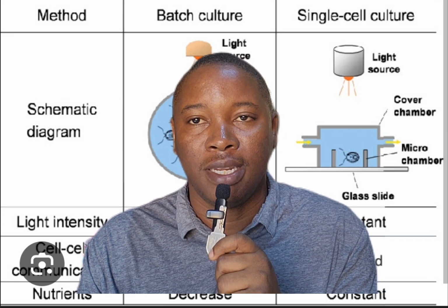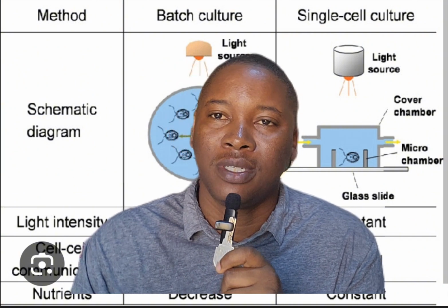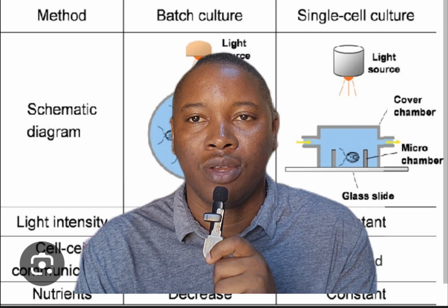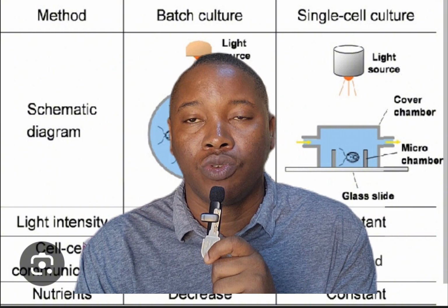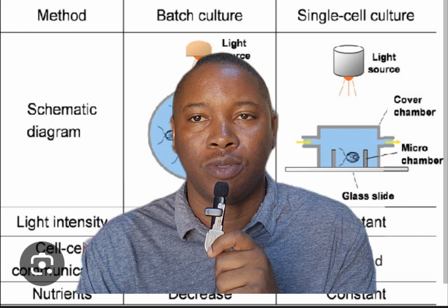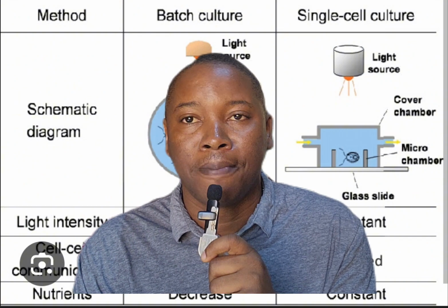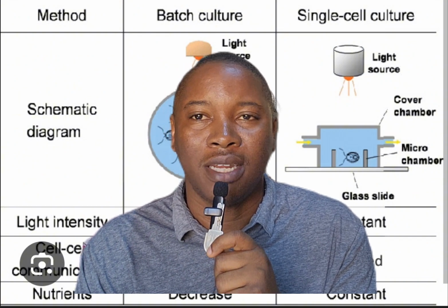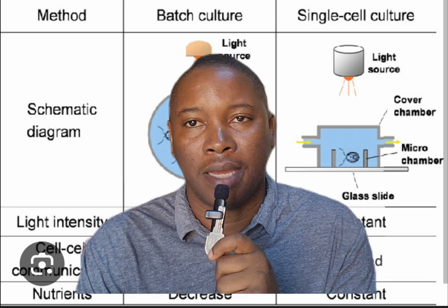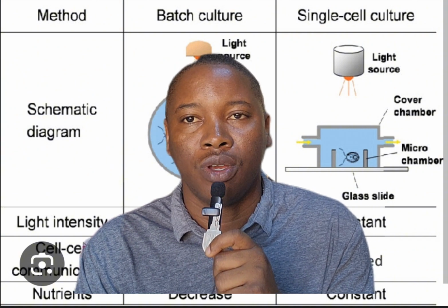After the media has been prepared, the samples from whatever we are taking, whether it is a water sample, soil sample, fecal sample, whatever it is, we then inoculate our media through many of the methods, either streaking, pour plate, spread plate, whatever method we are using, and then we allow it to grow. We incubate in an incubator. We set the right conditions for pH, temperature, pressure, and then over a period of time, many times perhaps 12 hours, 24 hours, 48 hours, we continue to observe.